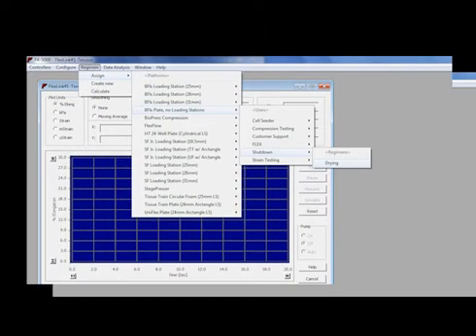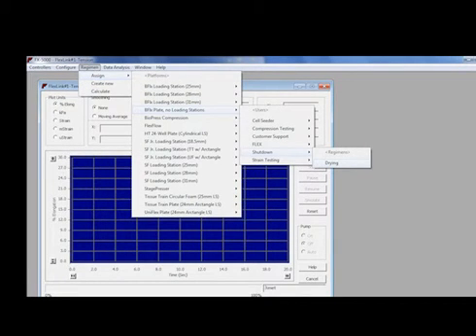To run this regimen, choose the appropriate Flex link from the Controllers drop-down menu. In the Regimen menu, select Assign.